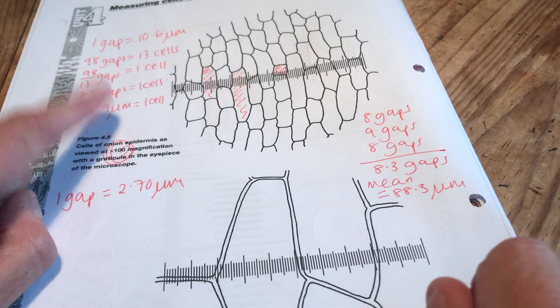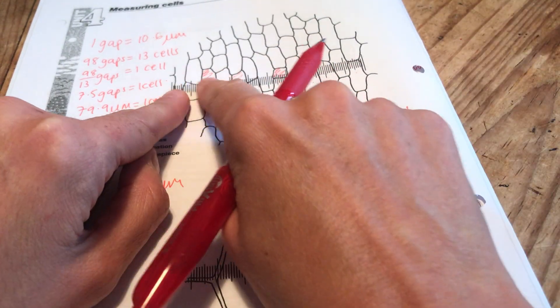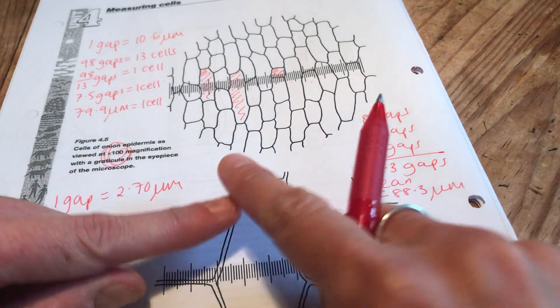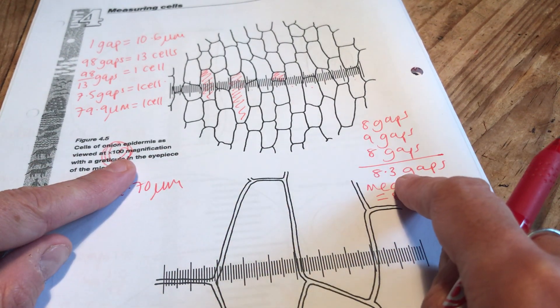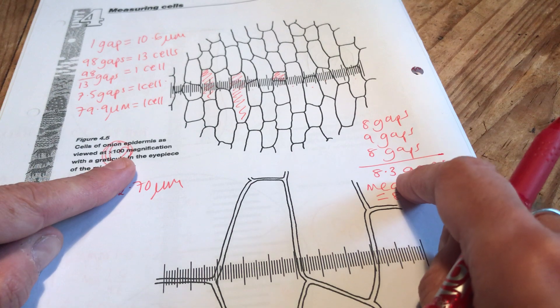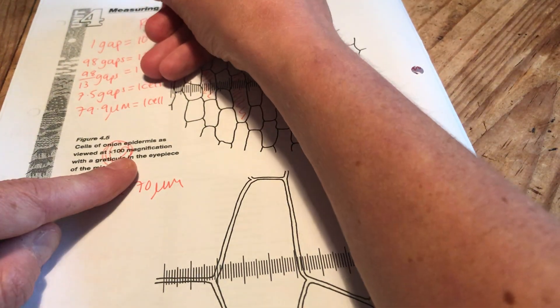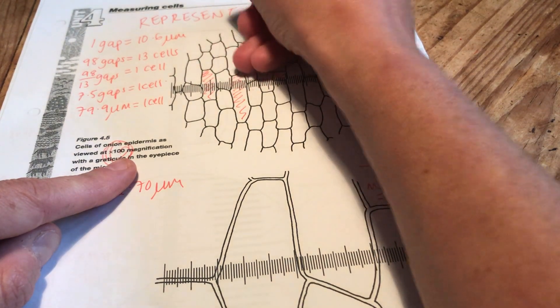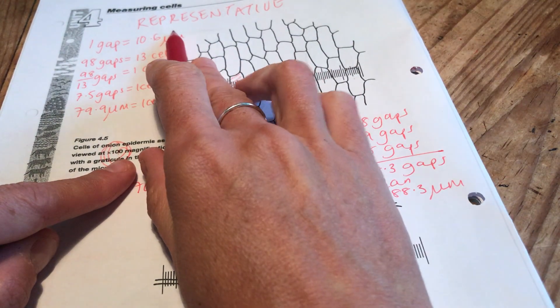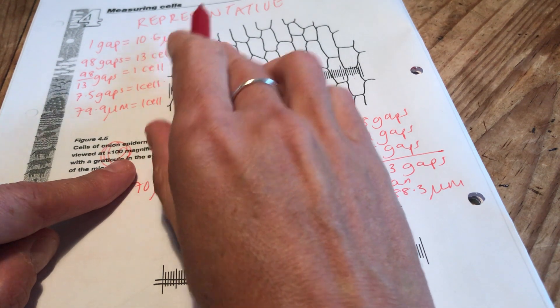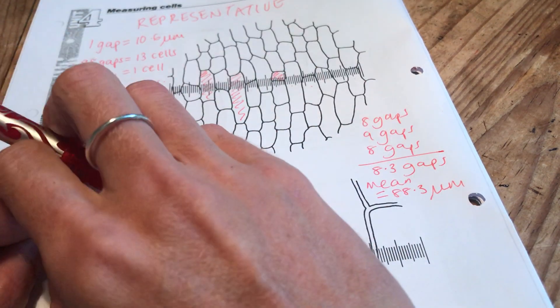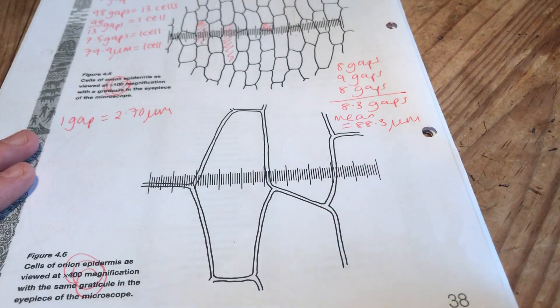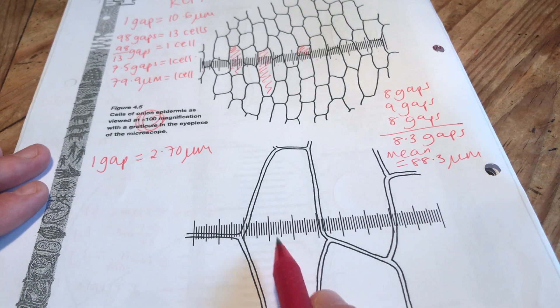Which of those two do I trust? This one. I trust this one more because this one I've taken a mean of 13 cells effectively, this one I've just taken a mean of 3. So the more cells you have in your sample, the more representative. That's the word that we want here. Really important word at A level. The greater the number of individuals in your sample, the more representative that sample is likely to be. The more reliable your mean, or representative your mean.